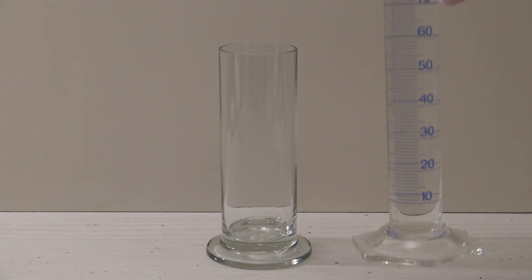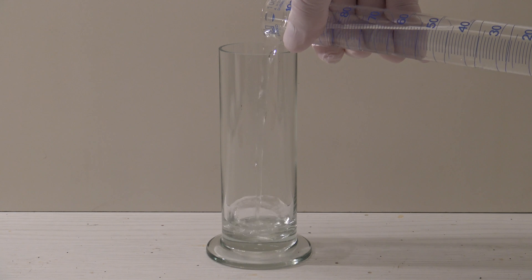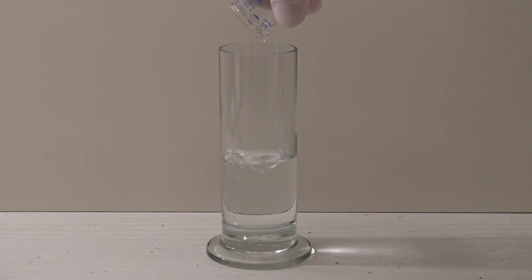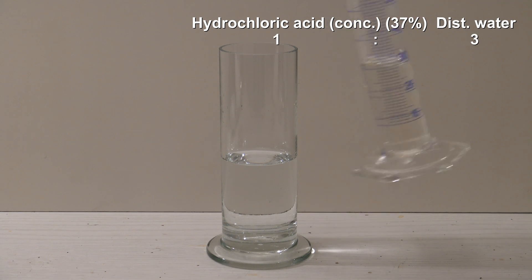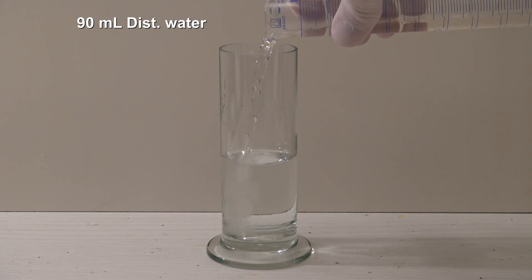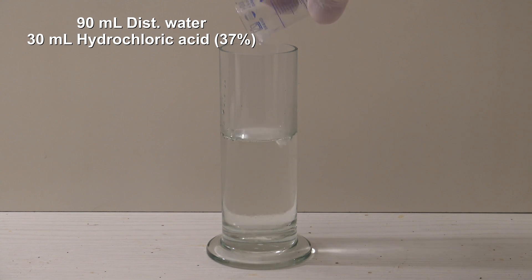For the experiment a container was filled with diluted hydrochloric acid. In this case a cylinder was used and concentrated hydrochloric acid was diluted at a ratio of 1 to 3. So to 90 ml of distilled water 30 ml of acid were added.